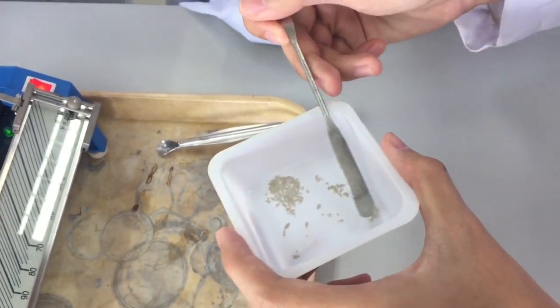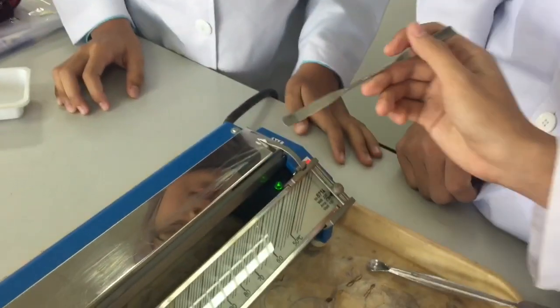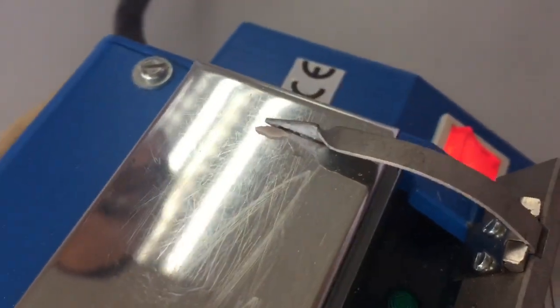A little acetanilide, which is impure or original stock, was taken and the melting point was taken by using the melting temperature measurement.